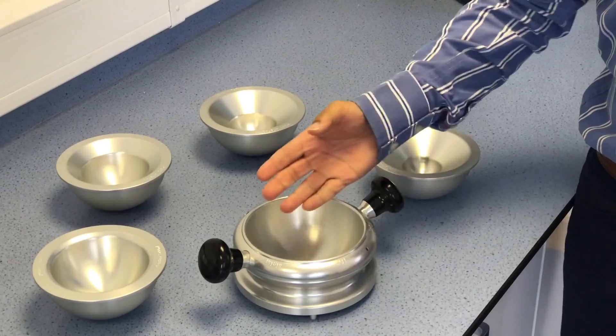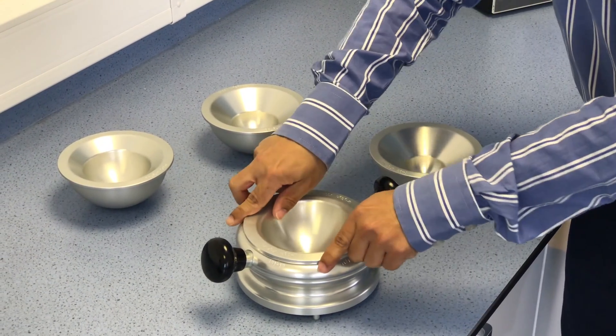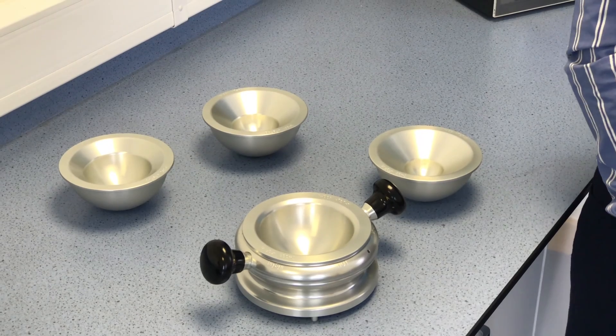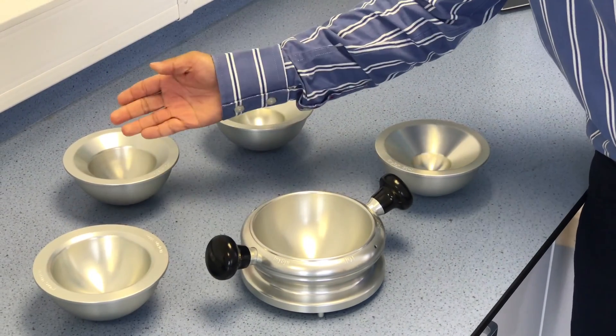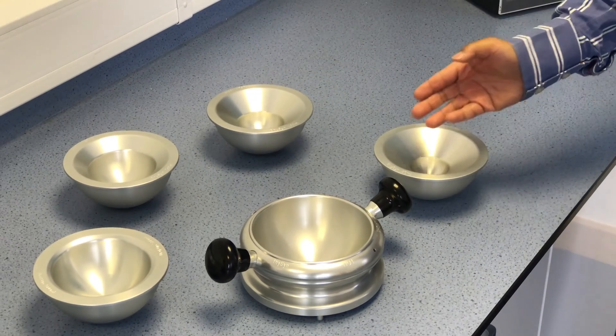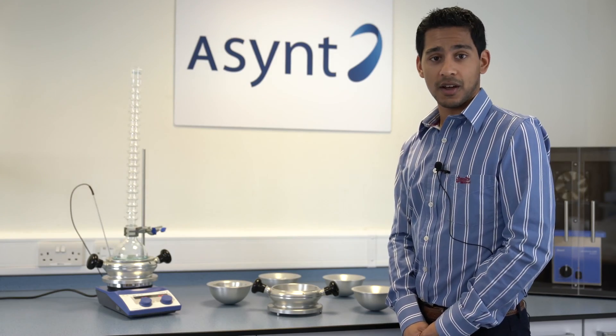As well as the 1 litre base, you get inserts to fit smaller flasks, which uniquely fit inside the 1 litre base. The inserts are 500 mL, 250 mL, 100 mL, and 50 mL, with an optional upgrade available for 25 mL flasks due to popular demand.